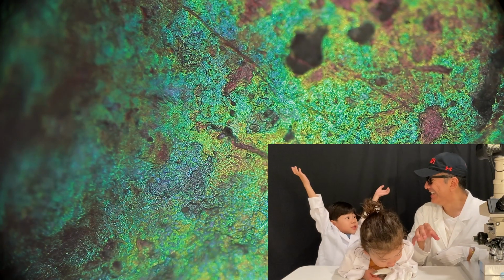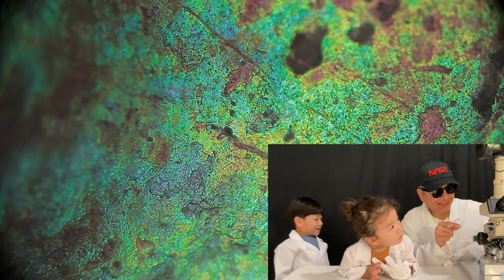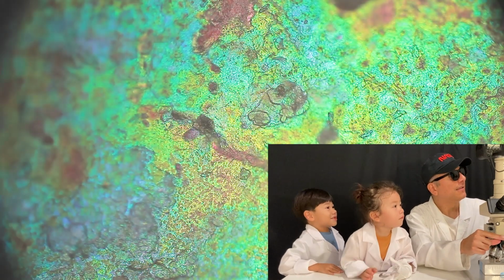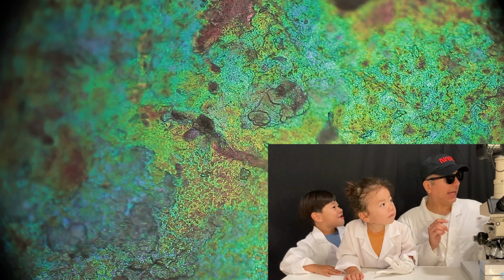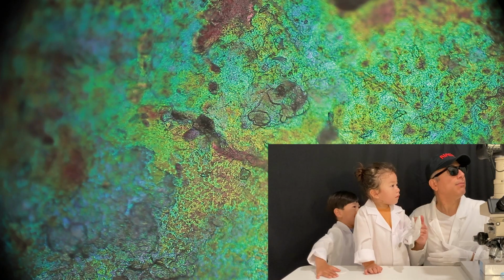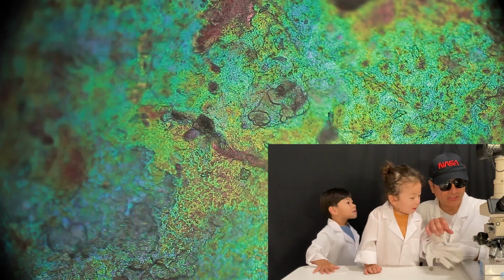We can go to 20x. Next one is 20. Here's 20x. Whoa, look at that one. There's blue and green. And now we see that crack on his shell.